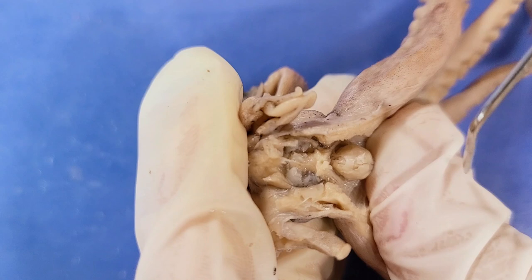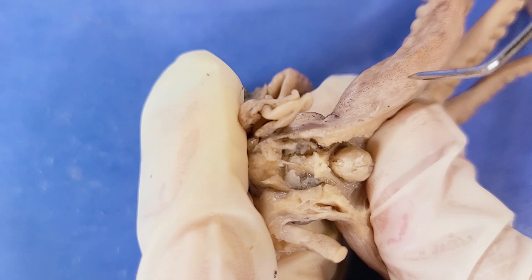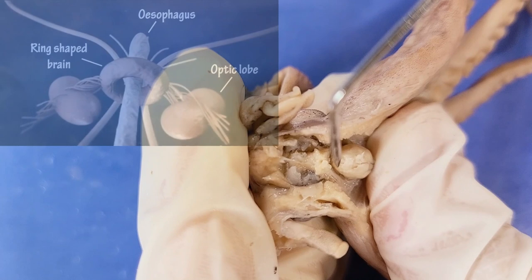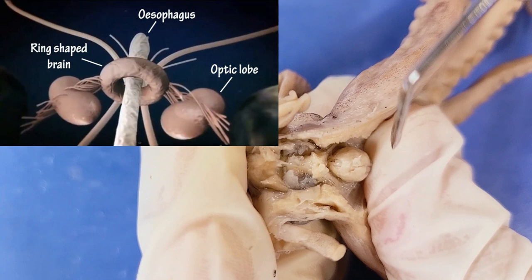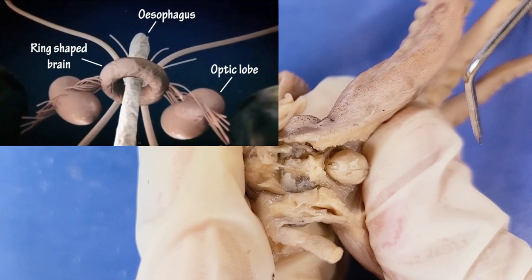Octopuses actually have a really decentralized nervous system, so they have 9 brains. The central brain right here, and a smaller brain in each of the 8 arms. This central brain here is actually donut-shaped, with the esophagus passing through the hole in the middle. Now this can be a bit awkward because it means that everything the octopus eats must pass through the brain. Although the octopus does have a beak to cut food into smaller pieces, if the octopus accidentally eats something too large, they risk brain injury or even death.